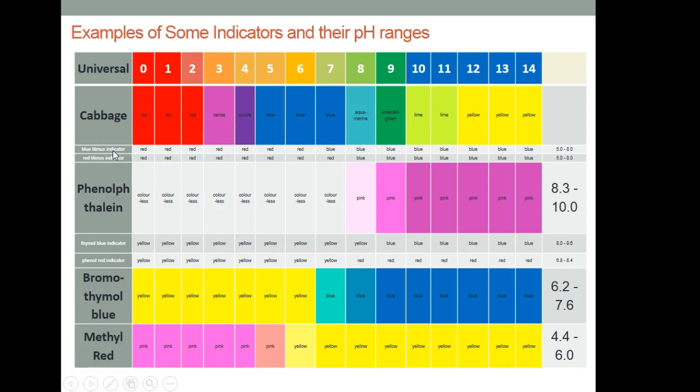Now, next, if we look at the blue litmus, you can see that it has one single distinct color change, if you're going from pH 5 to pH 7 or pH 8, all right? So between this 5 and 8, you can see that it has a color change where the red is gradually disappearing and then blue appears, all right? Okay, so if I'm using an acid-base titration whose endpoint is between pH 6 and 7, then I can definitely use a blue litmus.